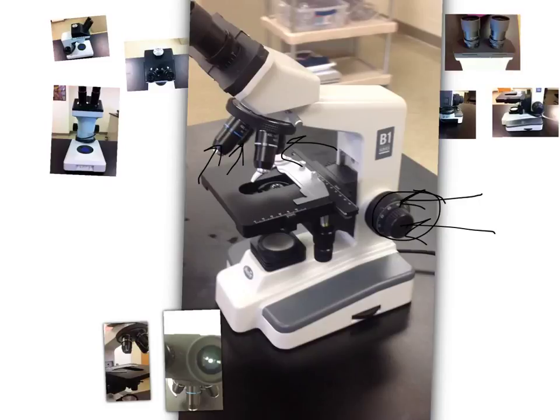And that's because you don't want your objective to hit your actual slide. Here, this is how we adjust the light. So you're going to be sliding it back and forth. That lets different amounts of light in. And again, this is how you move your stage. Do not move your stage manually. You want to make sure that you're using these different knobs to turn the stage left and right or back and forth.